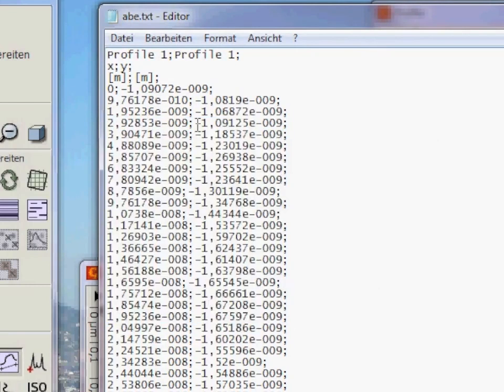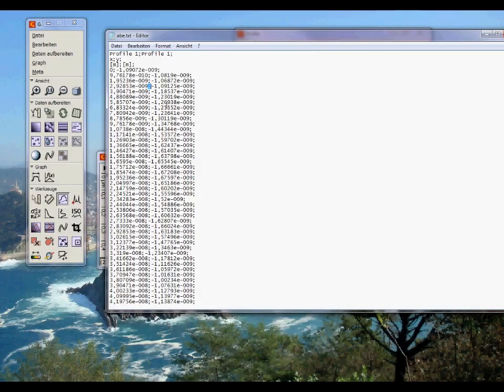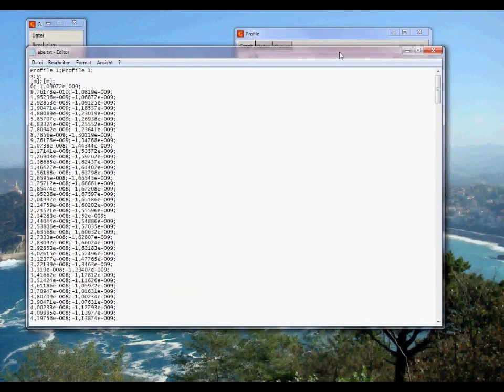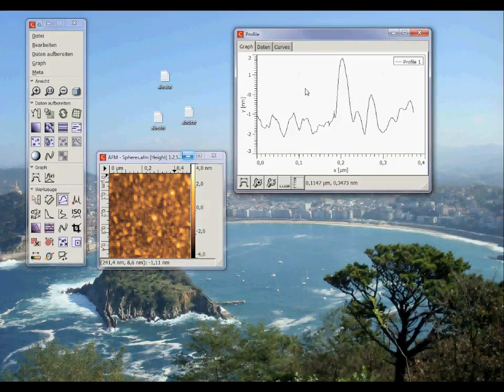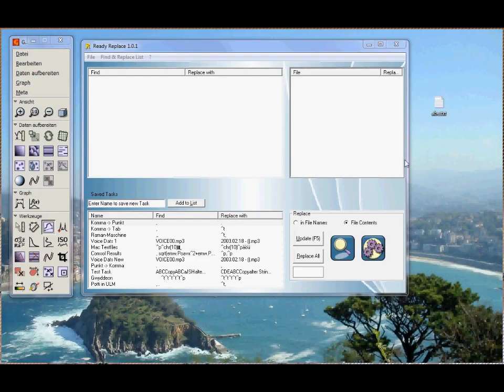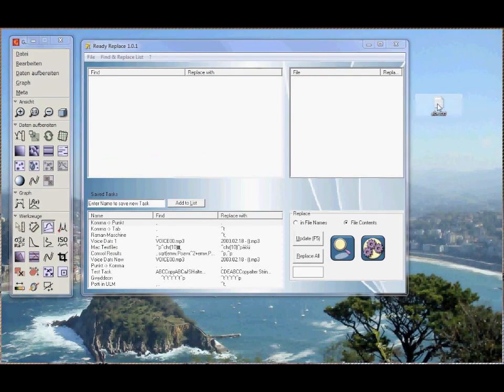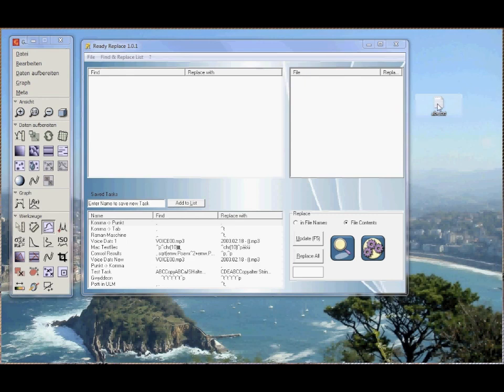Now if you want to use Excel, you just have to replace the semicolons with a tab. You can do this with Find and Replace or by using one of my programs ReadyReplace. With ReadyReplace you can find and replace text in files or in filenames. Also you can save tasks if you want to use them frequently.